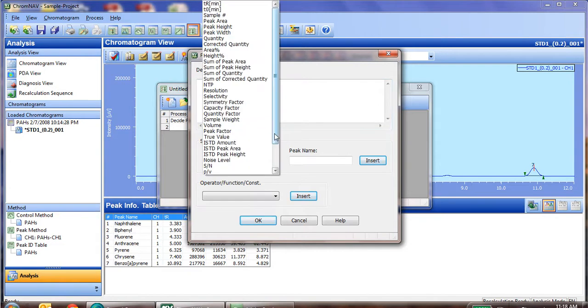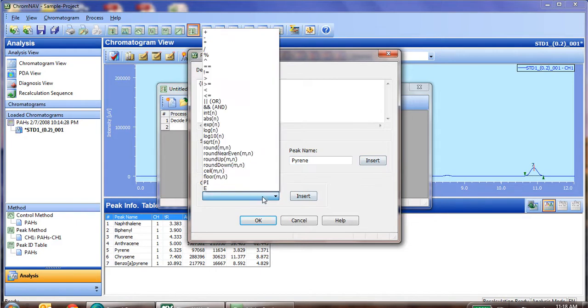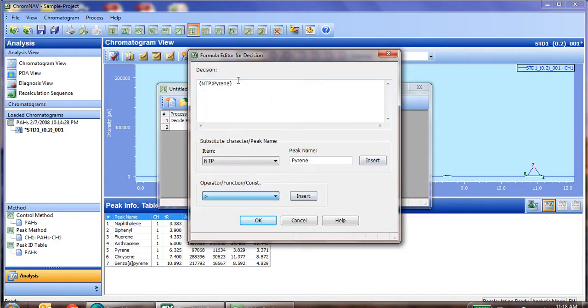In this case, as an example, we'll use the number of theoretical plates for the pyrene peak. So in this case, that value must be greater than 10,000 in order for the system to pass our test.